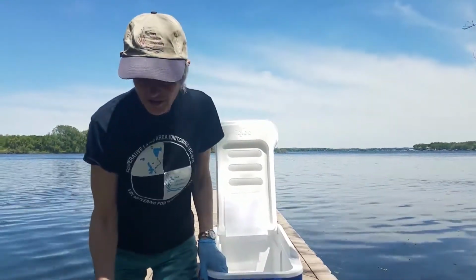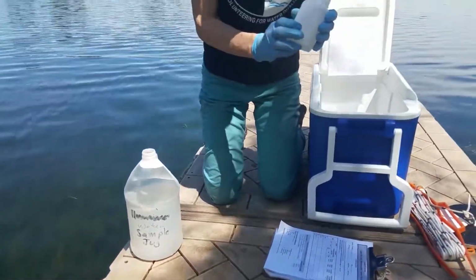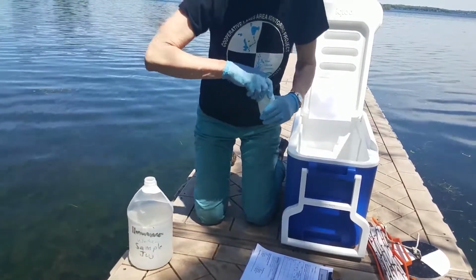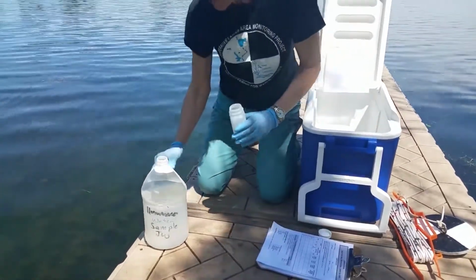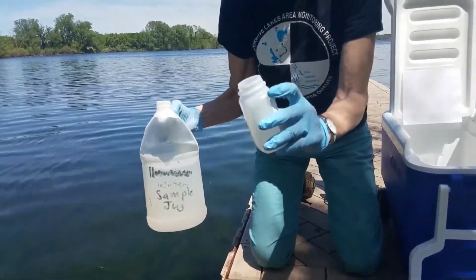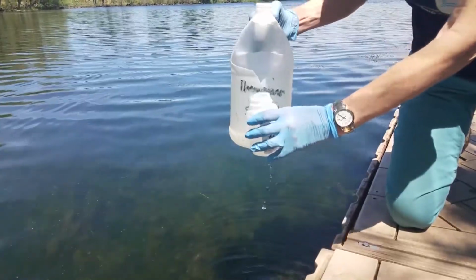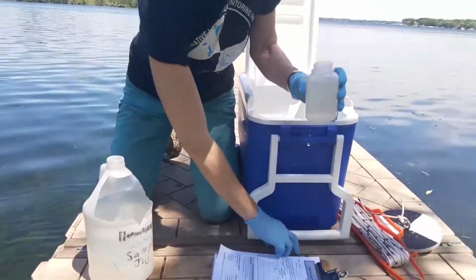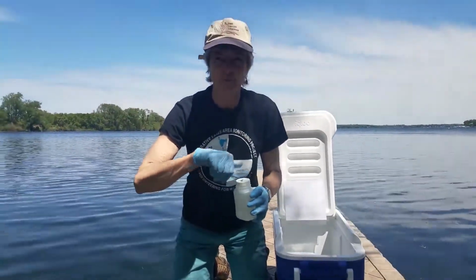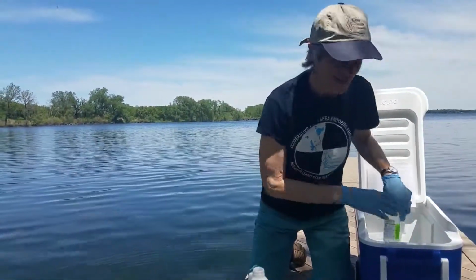Now your water is all ready to be poured into the containers. Like I said earlier, you have a larger jar that we use for our chlorophyll analysis. You just simply fill the sample up to the neck or the shoulder of the bottle, kind of leaning over our pretend boat here. This is where it's really good to have your partner helping. Your partner can be screwing the lids on or off or writing down the data.